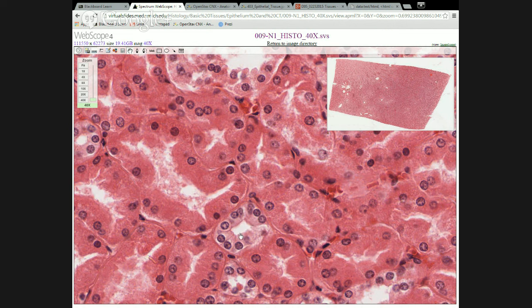Now, if we're looking at this cell right here, we can definitely say where I have the pointer is the bottom of that cell, where I have the pointer is the top of that cell. But that works because that cell happens to be oriented to our particular perspective. It's our top and bottom, or how we see top and bottom. But if we go to a cell up here, the top of this cell is where I'm pointing right now, and the bottom of this cell is where I'm pointing right now. Okay. It's sort of upside down and a little bit at an angle.